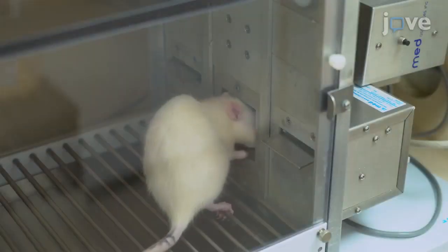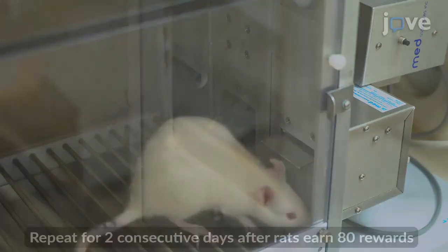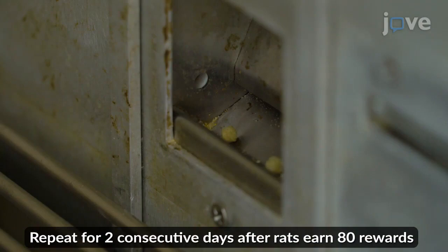For intertemporal choice and differential reinforcement of low rates of responding, or DRL protocols, place 1 or 2 levers into the chamber and deliver food for every lever press in conjunction with a free food pellet delivery every 45 seconds.